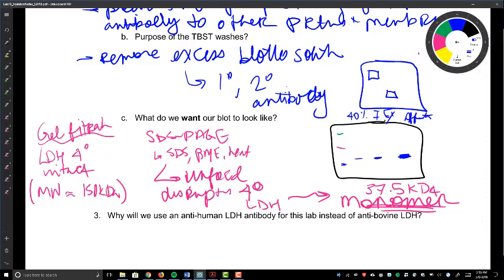So even though your total milligrams of protein might be going down, the concentration of other stuff and ultimately the volume of your sample is going to go down. So in theory, your LDH concentration should increase as you go through purification. Again, the hallmark is that you only see one band corresponding to LDH, it's the right molecular weight, and the band intensity increases with progressive purification.